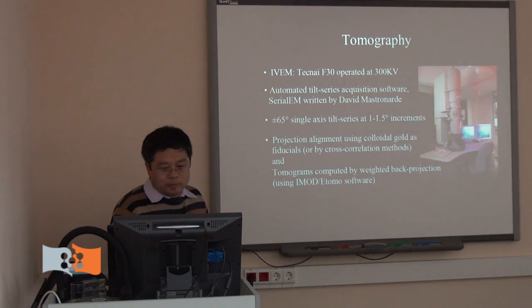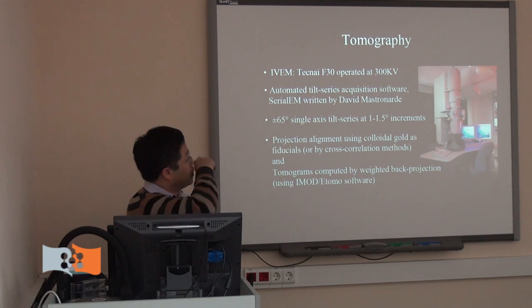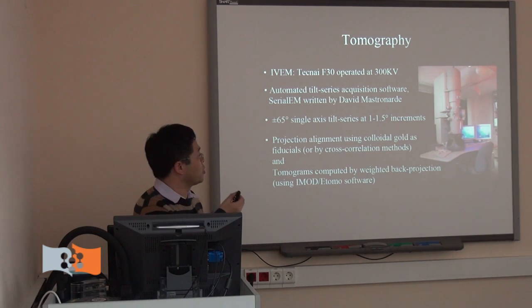So basically, we can do a dual-axis set or other things. That's basically the idea of electron tomography.